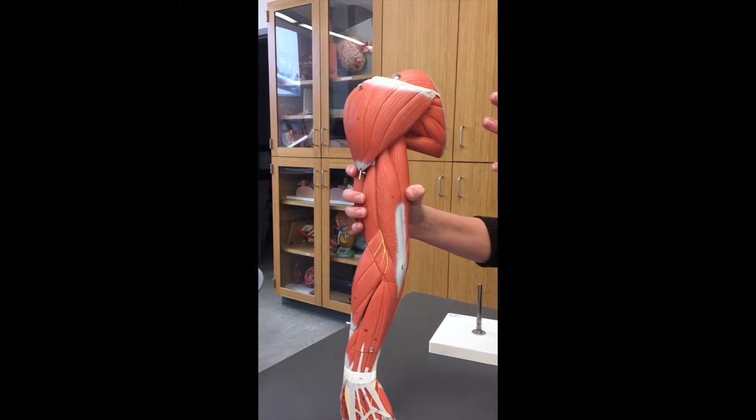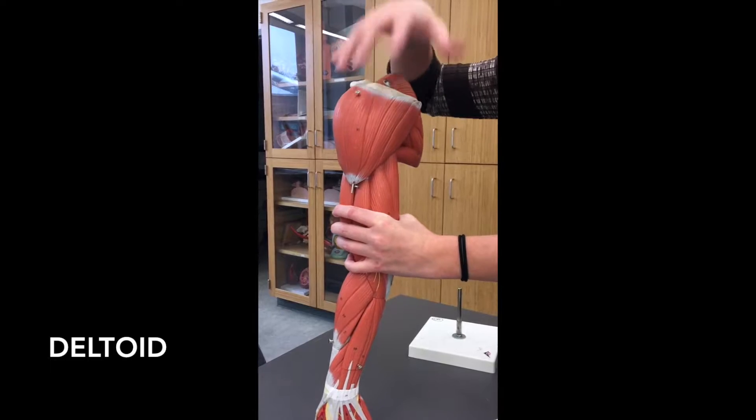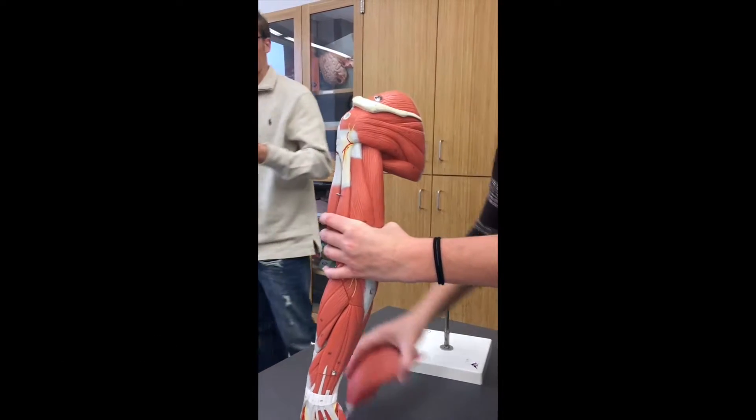Starting off on the upper arm — starting the shoulder. This large shoulder muscle here is going to be your deltoid muscle, and we actually need to remove that to see the rest of the shoulder muscles pretty well.